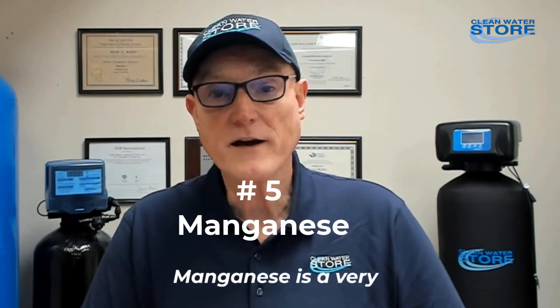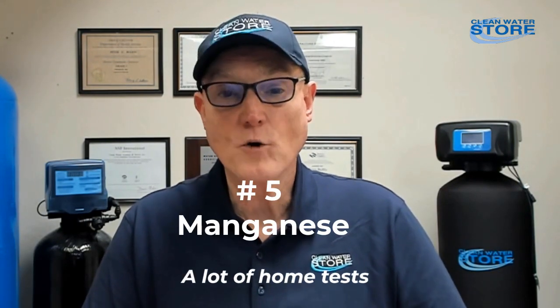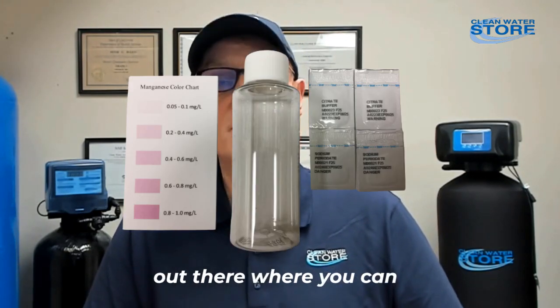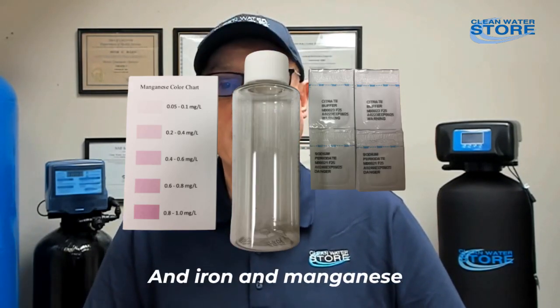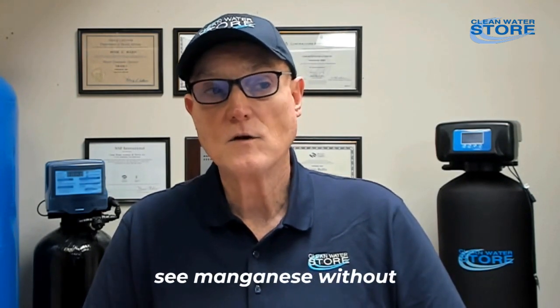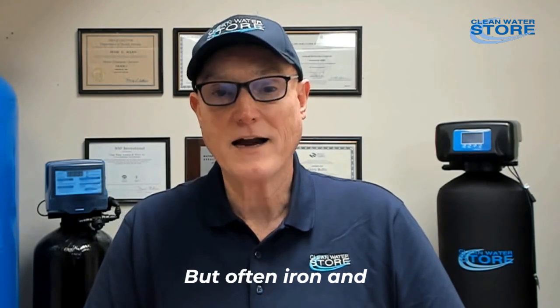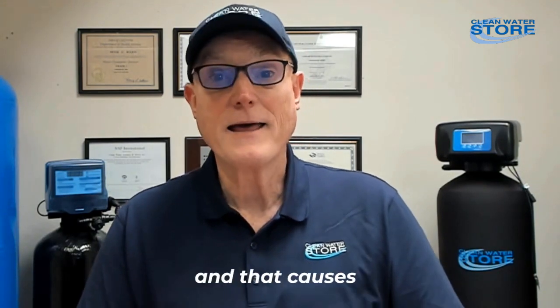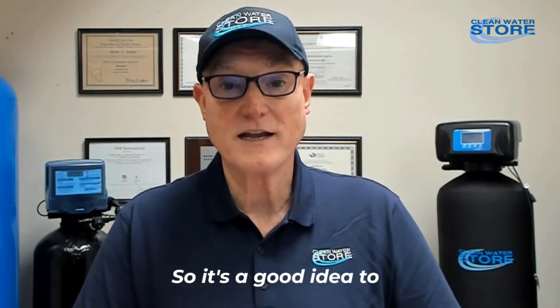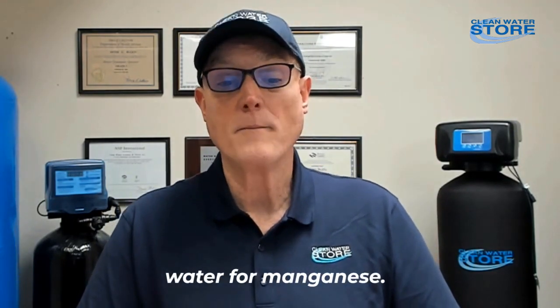Manganese is a very common stainer. A lot of home test kits don't include it, but there are test kits that can test for manganese. Iron and manganese often go together, though sometimes you see manganese without iron. Manganese causes a black or tea-colored stain, so it's a good idea to be able to test your water for it.